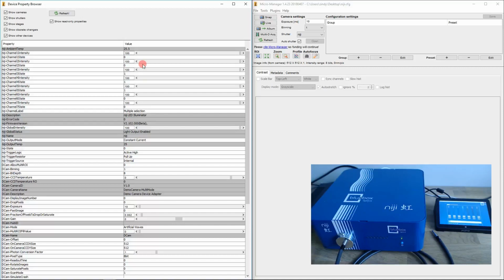So for a group comprising all 7 states, we can have any numbers of presets with any combination of single or multiple LEDs. And likewise for the intensity, we have a global intensity control that controls all the LEDs at the same time. Or we can have multiple controls, one for each LED intensity.